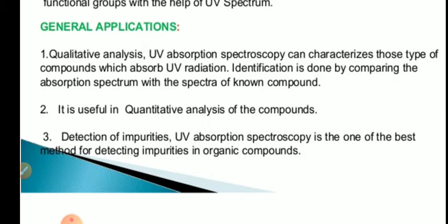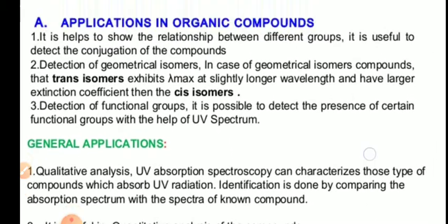It is also useful in quantitative analysis. How can we do quantitative analysis? By applying Beer's law. We'll come to that.